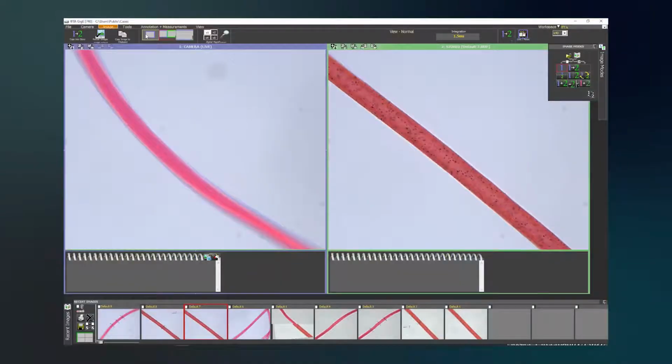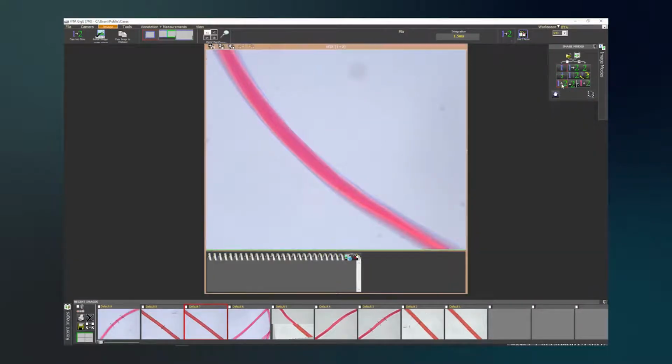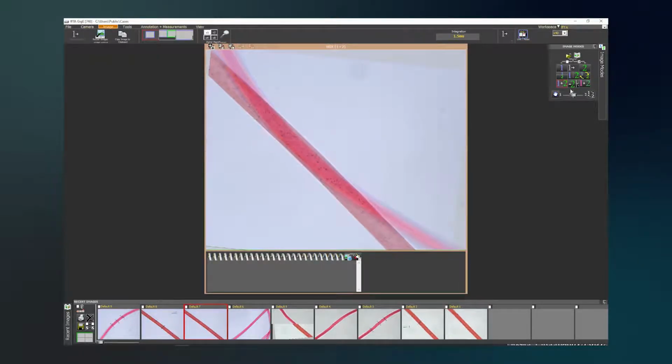We can see that side by side they are in fact very different physically. We can use the imaging modes to perform an overlay as well, so we can mix the two images together. We can use the software to superimpose the two images over the top of one another, like so. And then we can use various imaging features like a horizontal split or a vertical split. So here we can really point out the differences between the fibres. We could put on a strobe effect, so we can strobe between image 1 and image 2.